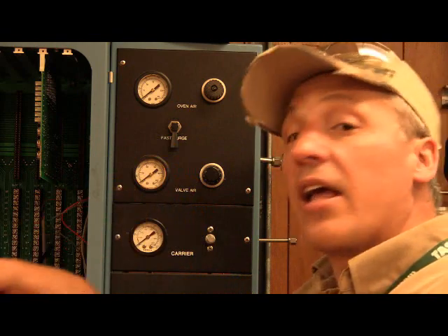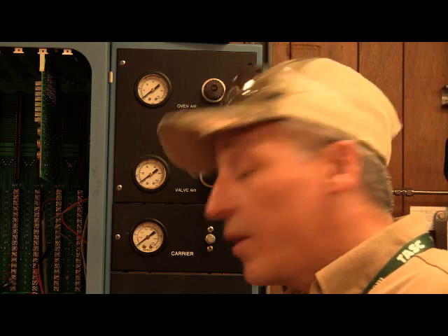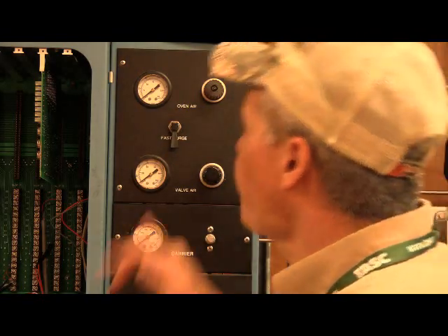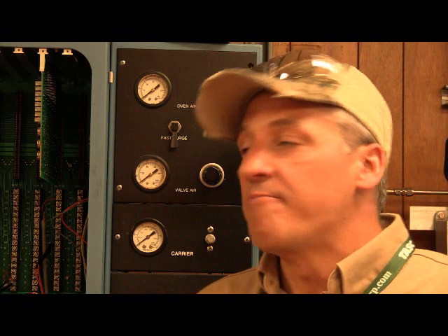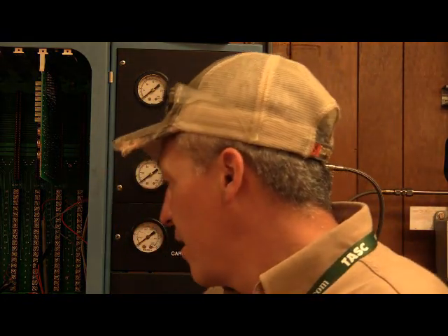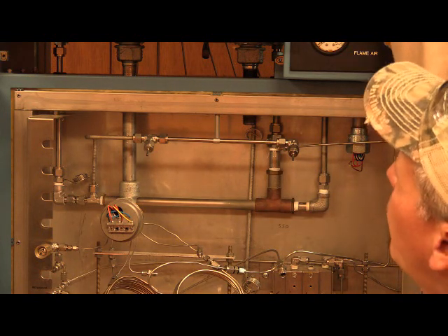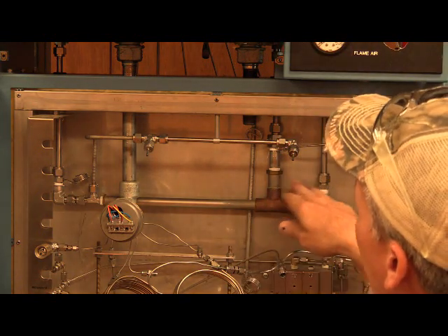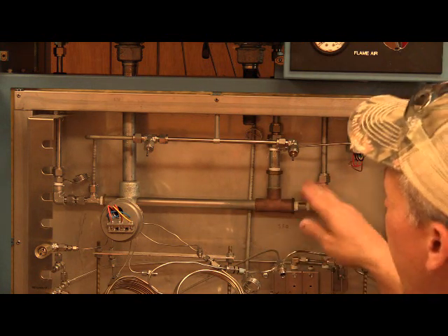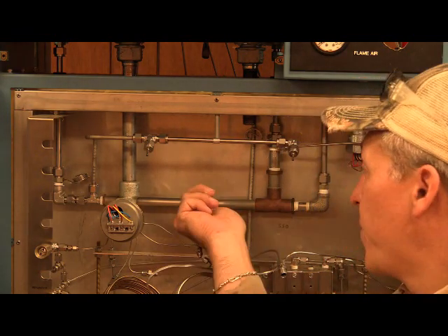Carrier gas pushing everybody through. Valve air stroking our valves that are doing the on-offs to send the gas through the oven. Oven air. Oven air is going to be 15-20 psi. The air is going to come off of the oven air regulator. It's going to come through and go down into the heater. The heater is 120 volts, which warms up the inside here.